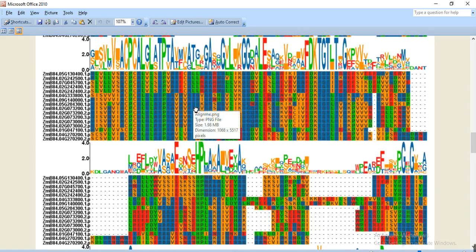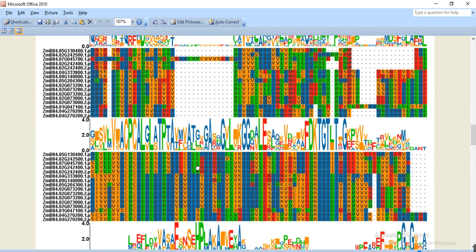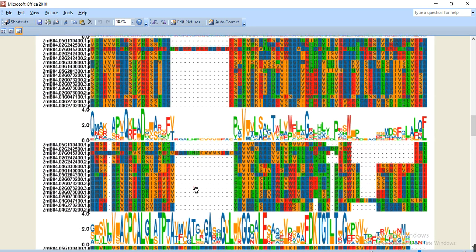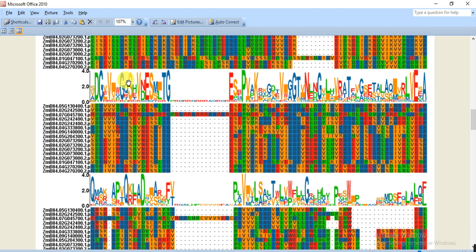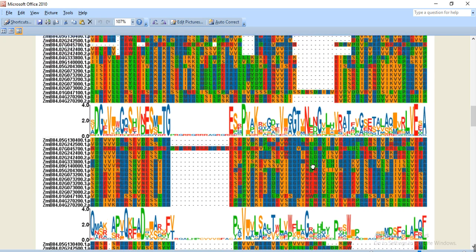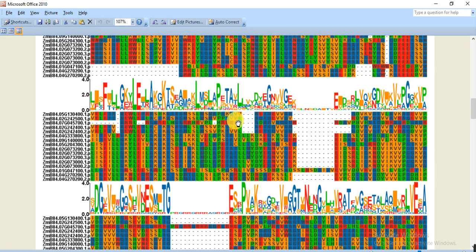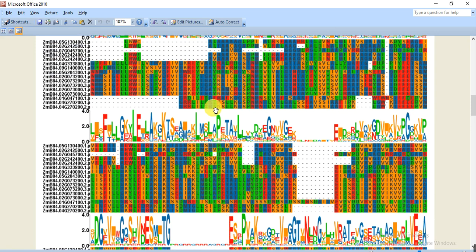We have to maximize it. So you can see that after maximizing or zooming up to 300 or 400 pixels, we can clearly see the amino acids. At the top, this is the signature of each line or motif. You can see that the green color shows about 100 percent.